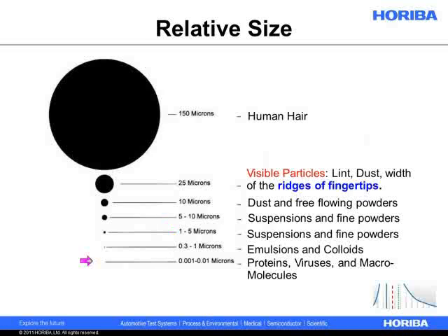But we can get even down here to the point where, on the same scale, we can't even look at the size of the dot. It's so small. And that'll be proteins, viruses, macromolecules, very, very small things, colloidal golds, very small particles.